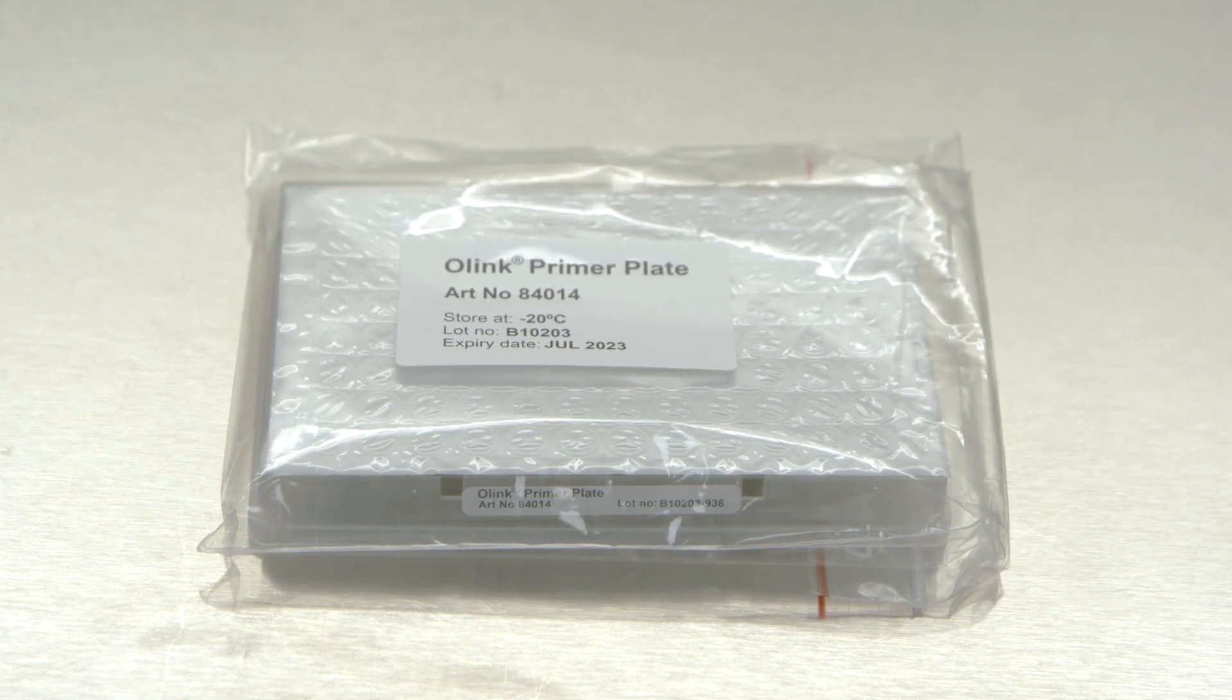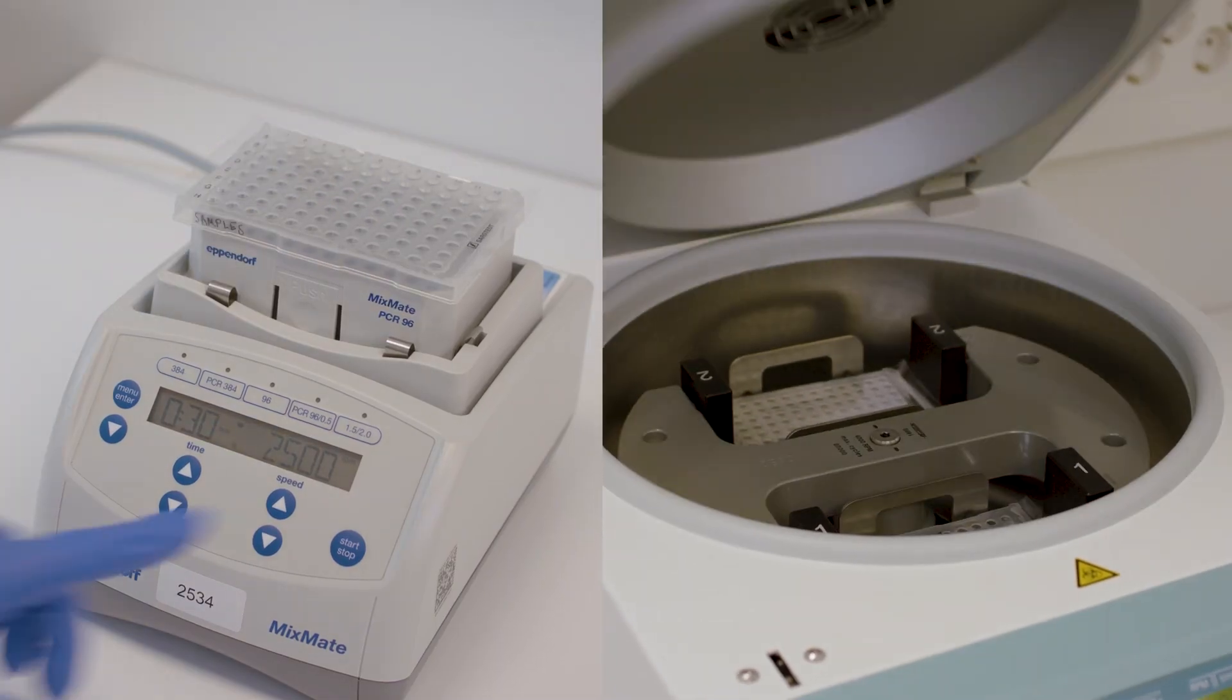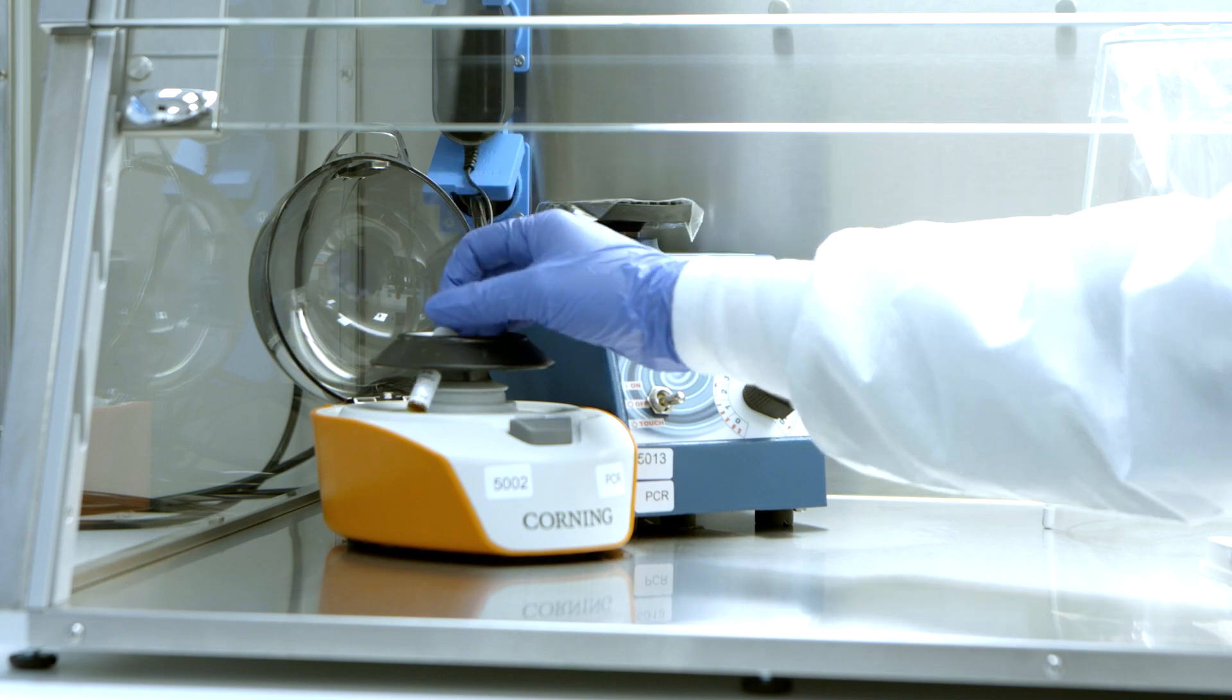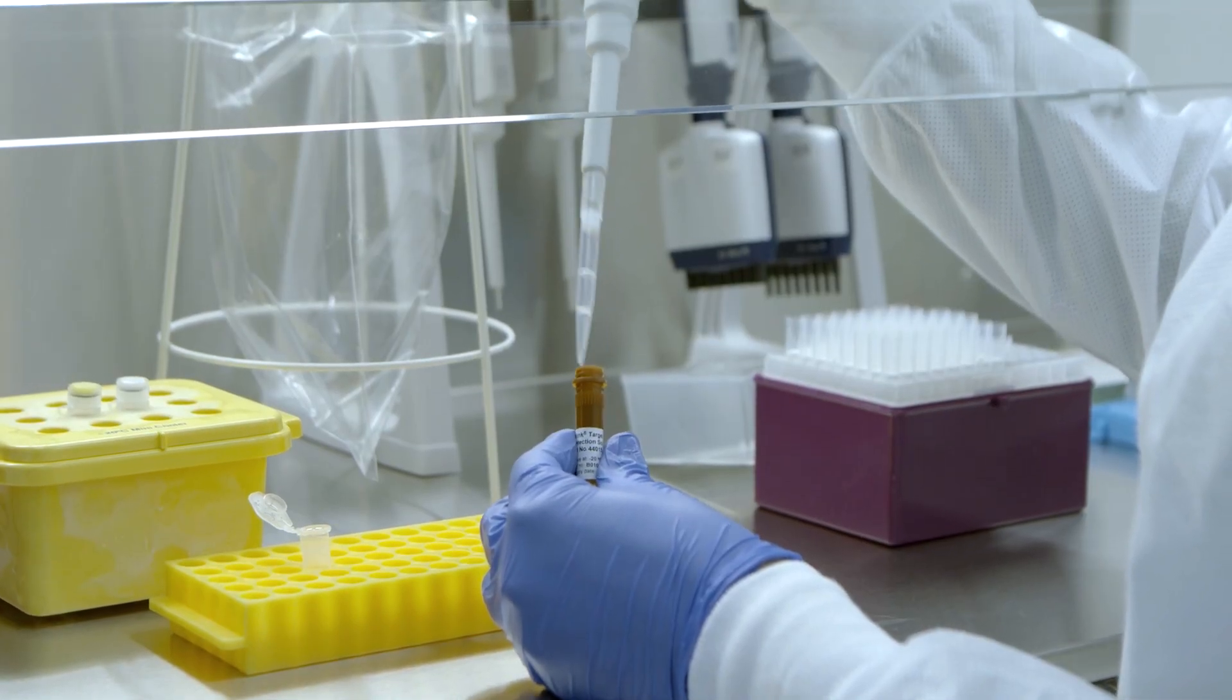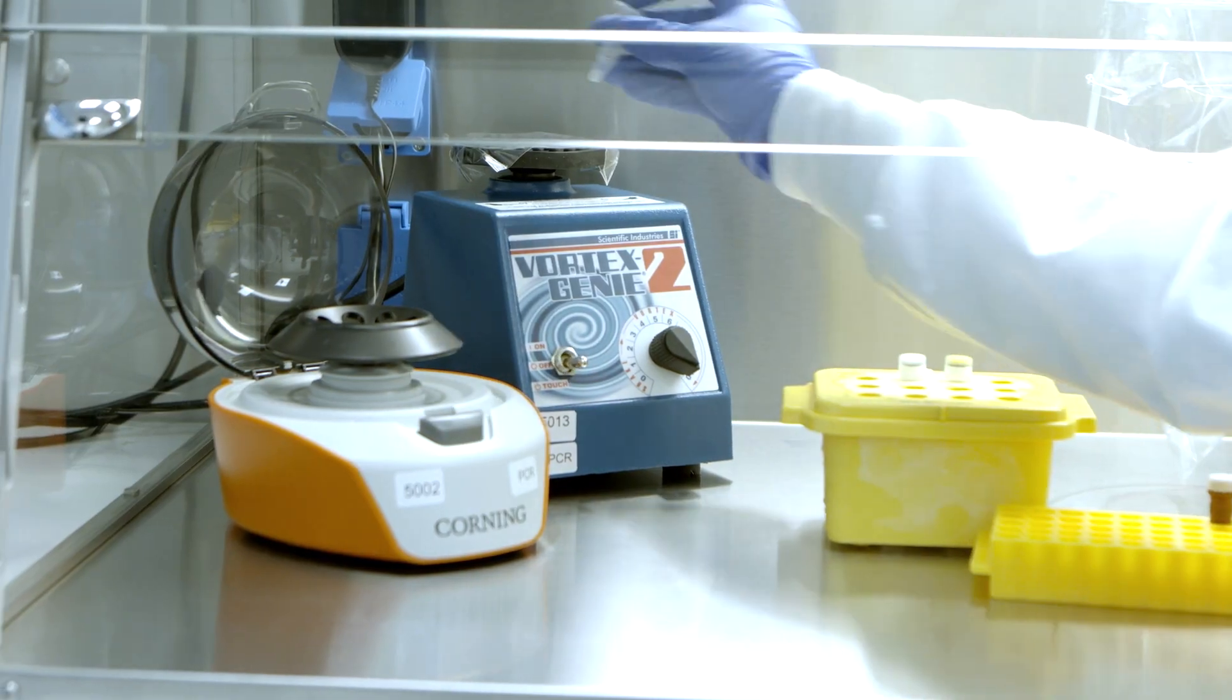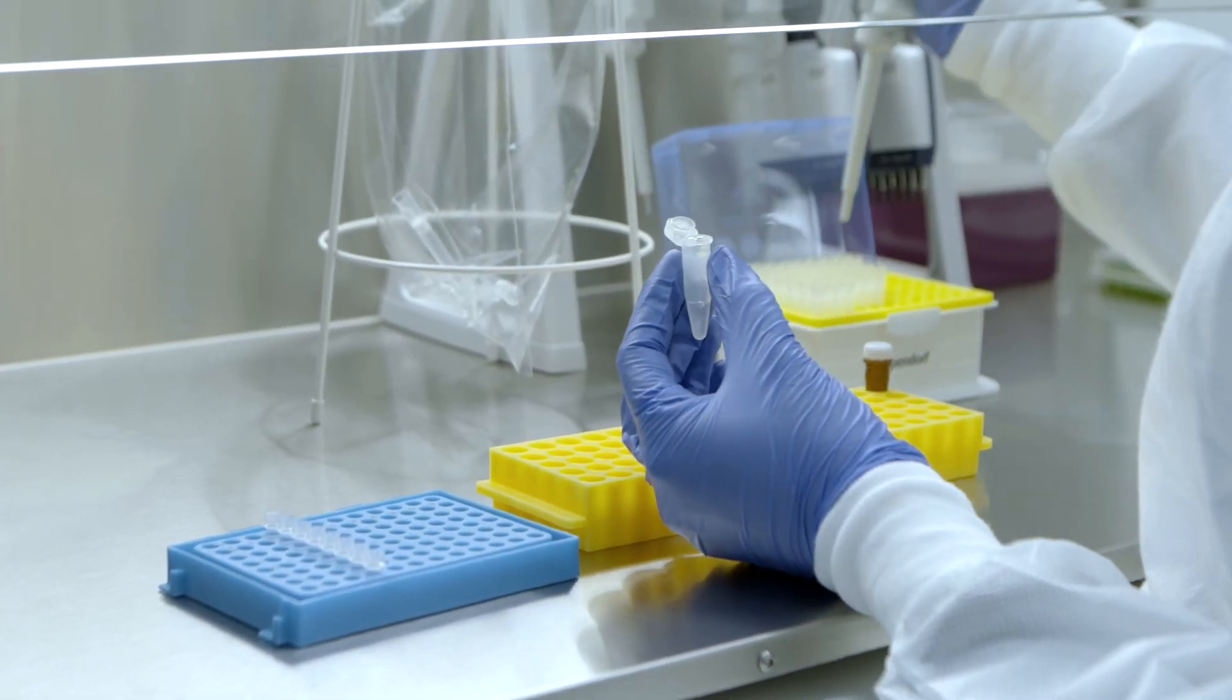Thaw the primer plate. Remove the incubation plate containing the PCR product from the PCR instrument. Vortex and spin down the content. Thaw the detection solution and vortex and spin down the detection solution and primer plate. Bring out the detection enzyme and PCR polymerase, and remember to place them on a freezing block. And prepare the detection mix in a microcentrifuge tube according to O-Link user manual. Vortex and spin down the detection mix before transferring 95 microliters of the mix to the bottom of each well of an 8-well strip using reverse pipetting.